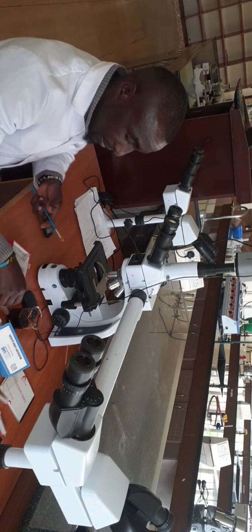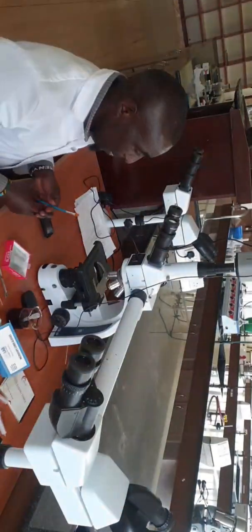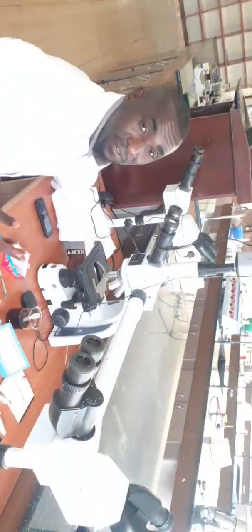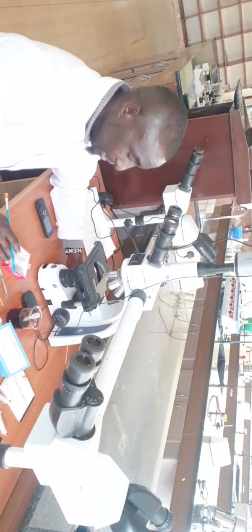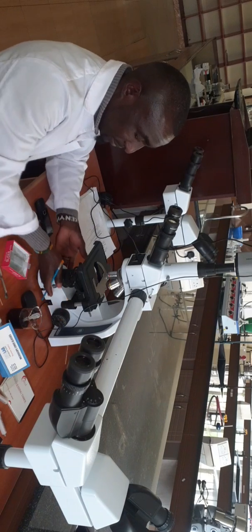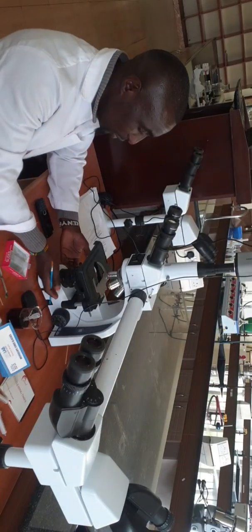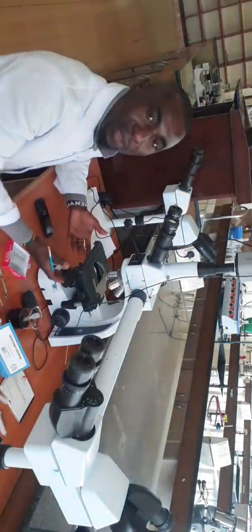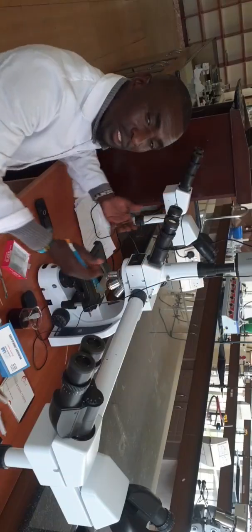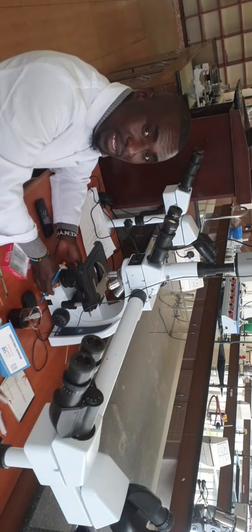With my microscope, I'm just going to explain a few parts of this microscope. The first part of this microscope is the base. This is the base, where the microscope can stand, what holds the microscope body. So this is the base. It stands on its base.